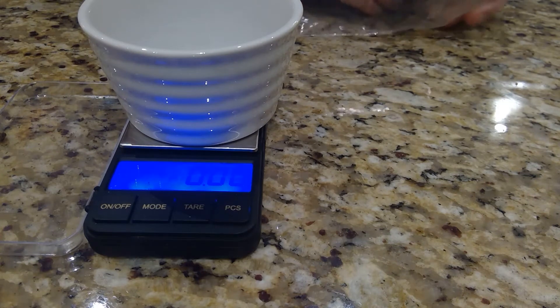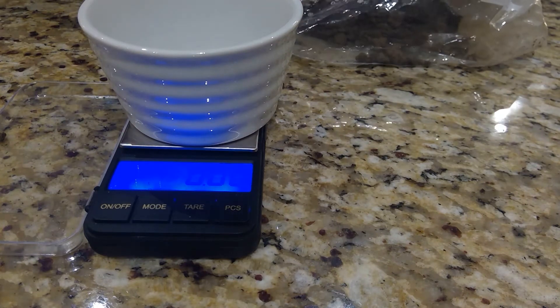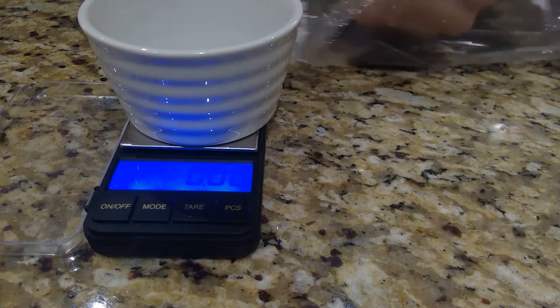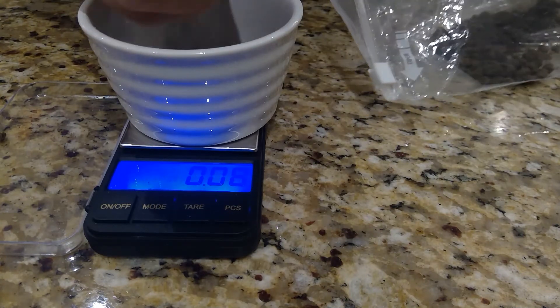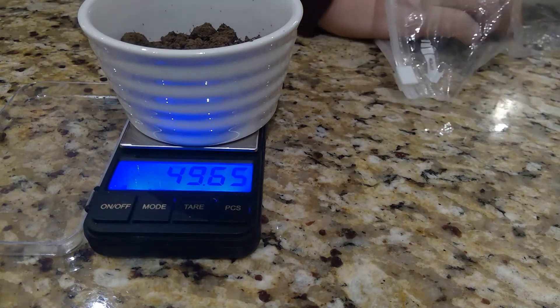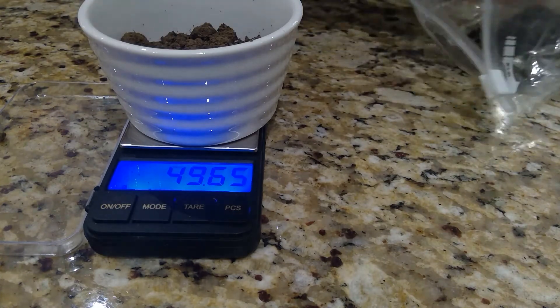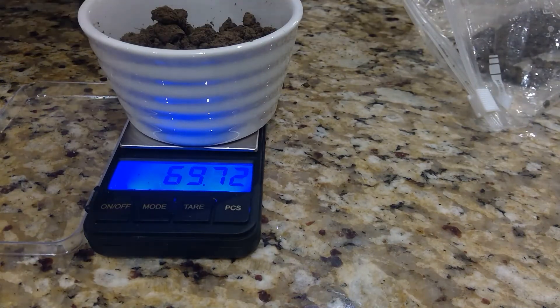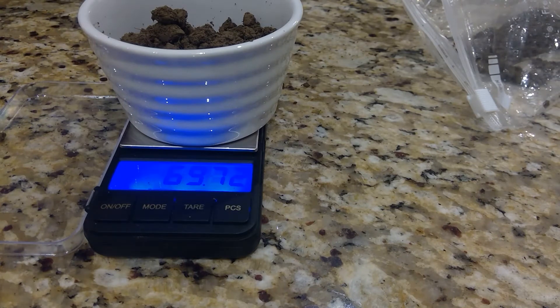I have removed all parent material — small rocks and pebbles — from this soil sample, so I'm just looking at the soil and not a lot of rocks in it. I have 69.72 grams.